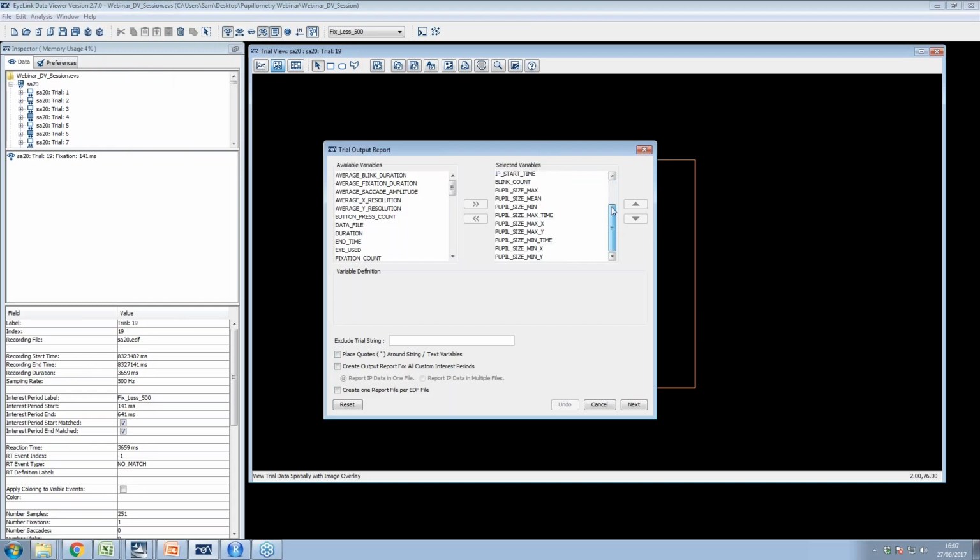And you will see I've chosen a few variables. These are variables that are part of my experimental script. So block is the variable that actually encodes condition, believe it or not, whether it was a fractal, happy, sad, whatever. Image is the image name. This is just trial. I think type is whether it was color or black and white. I've output the interest period start time.